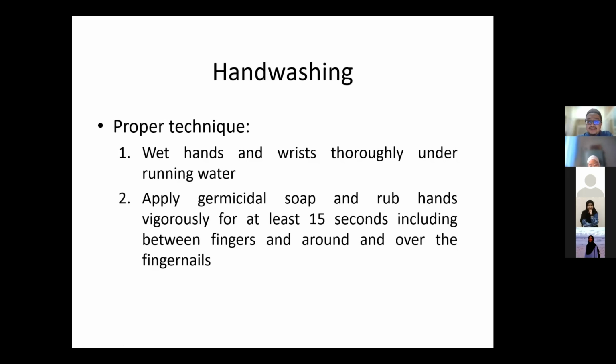If you notice, even in hospitals these days, dia dah lah bagi hand sanitizer tu sikit, just one tu, macam masjid tadi, masjid UIA, dia sikit sangat, nak rub macam mana kan? So actually there must be a certain quantity. So if it is very small amount, if we want to rub for 15 to 20 seconds pun tak sempat, because the hand sanitizer have a lot of alcohol. It will vaporize. Within 5 seconds dah habis. So it defeat the purpose.